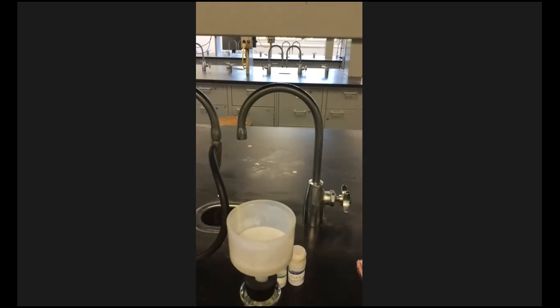And if you look at the filtration part, number one talks about the vacuum filtration apparatus and sealing that filter paper down by wetting it with some water, right? You want to wet it because, again, you don't want any of your product to go over the side.